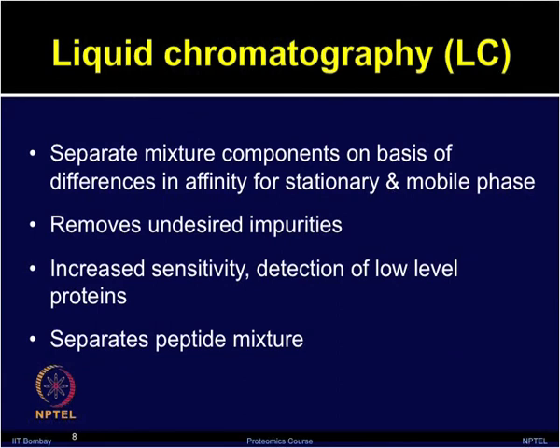The peptide mixtures can be fractionated in line with the instrument prior to introduction into the mass spectrometer. That is, I think, one of the advantages for proteomic applications. So, LC can separate mixtures or components on the basis of differences in the affinity for stationary and mobile phase.